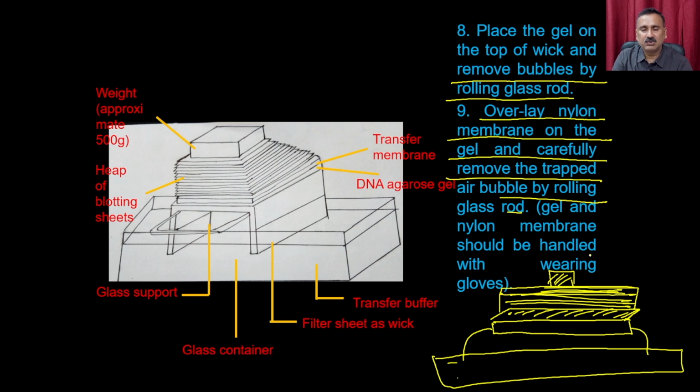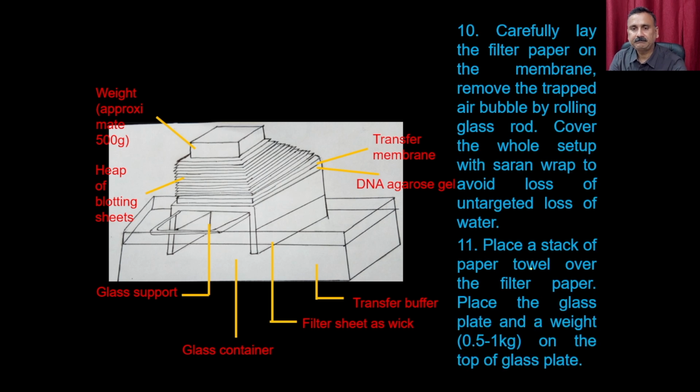On the other hand, the human body is not sterile, so it may also carry bacteria and other infectious or non-infectious organisms, which contribute their own DNA and may increase the background. So, it is very important that you perform all these steps with the utmost care and cleanliness, and wear gloves so that nothing goes from your body.